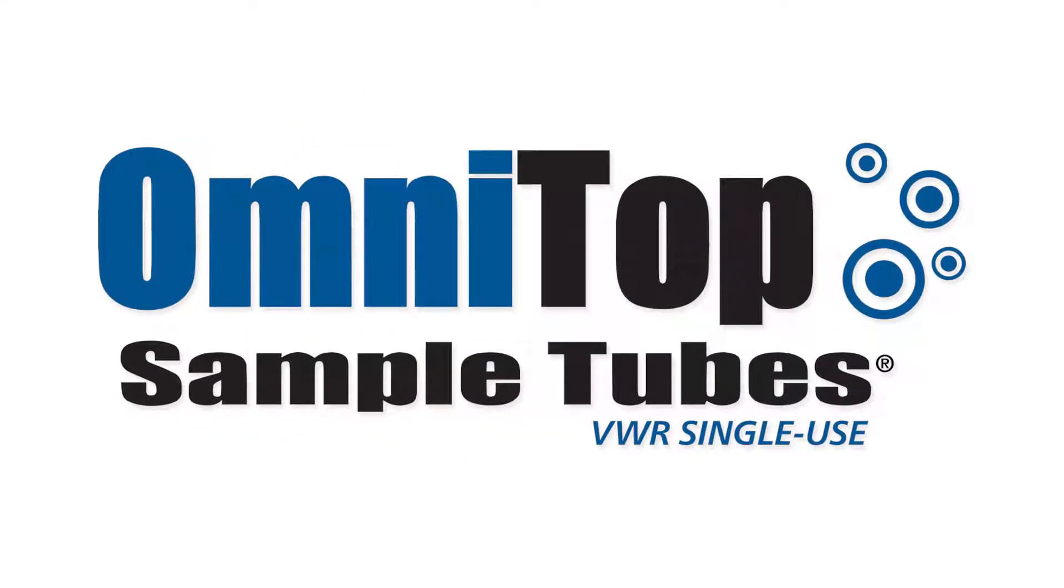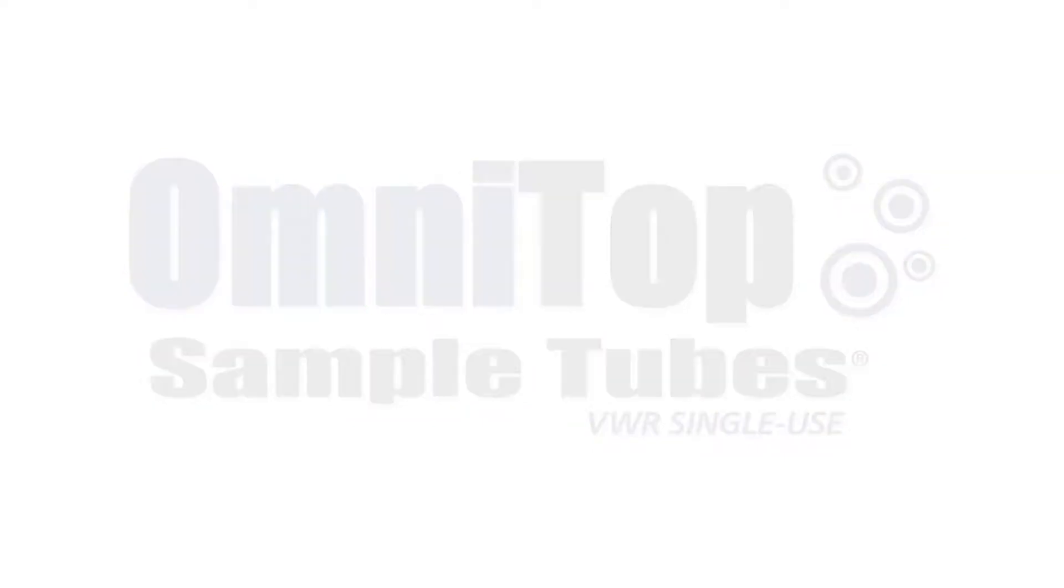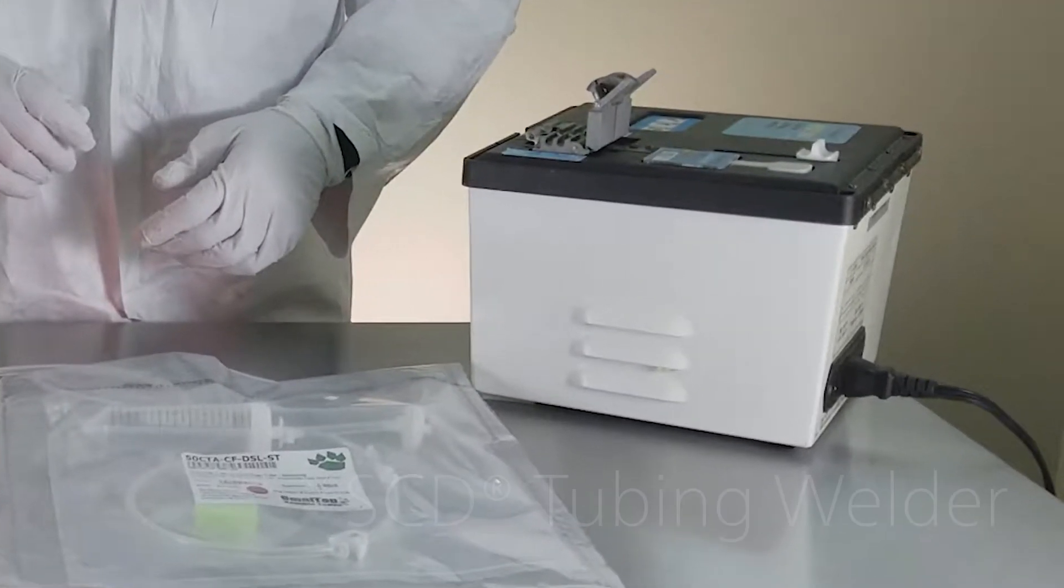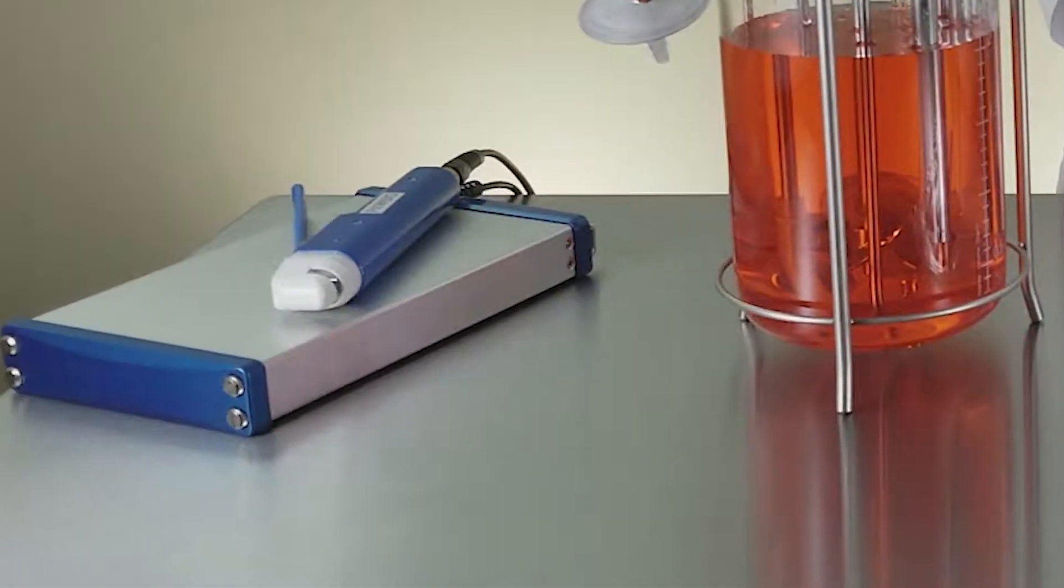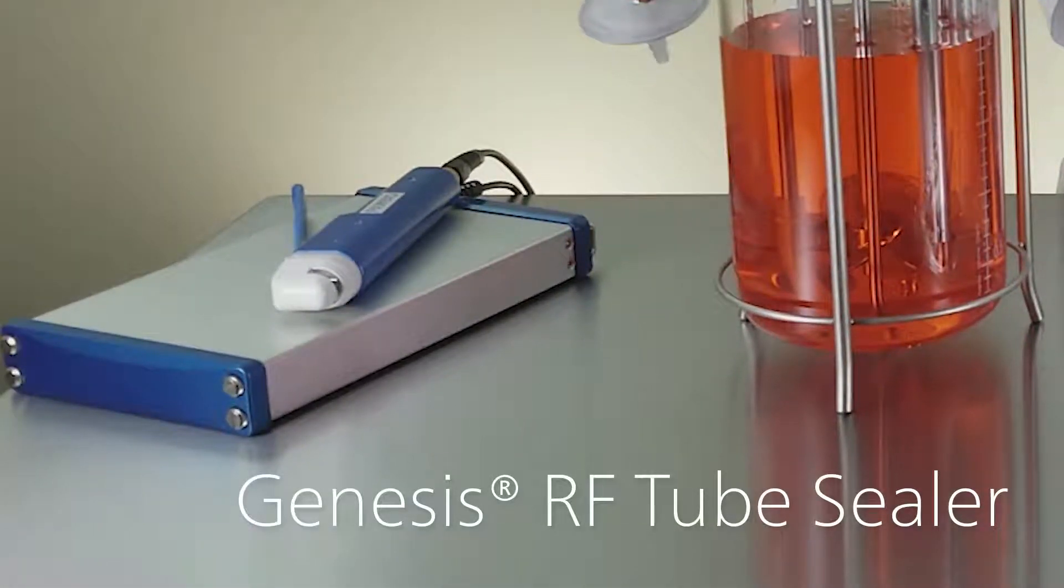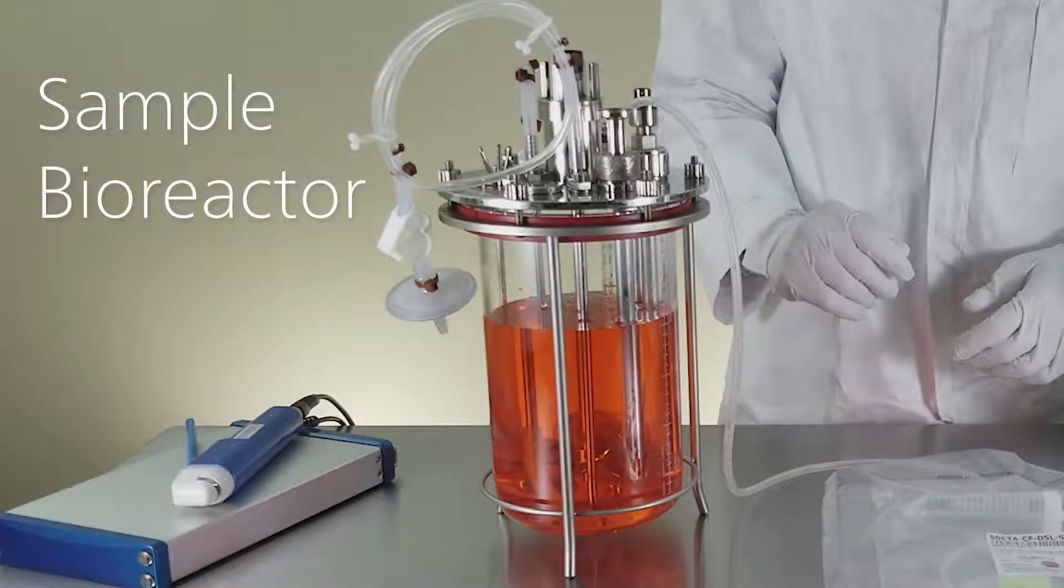Today we're going to show you how to transfer fluid with VWR single-use Omnitop sample tubes. To the right is the SCD tubing welder, on the left the Genesis RF tube sealer, and this is a sample bioreactor.